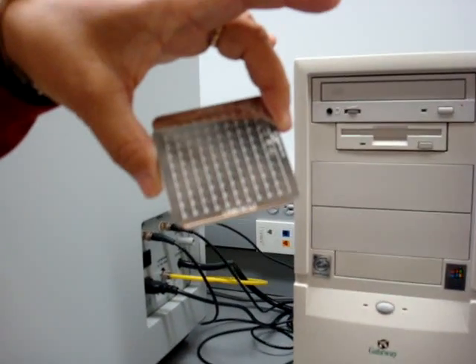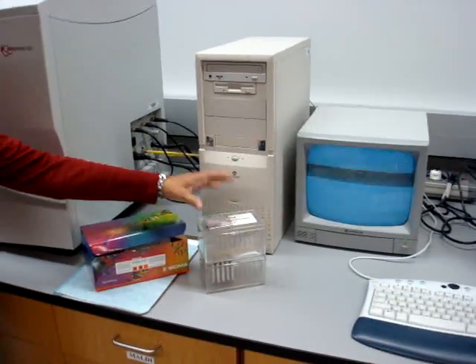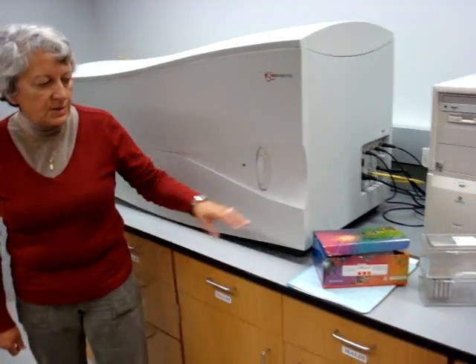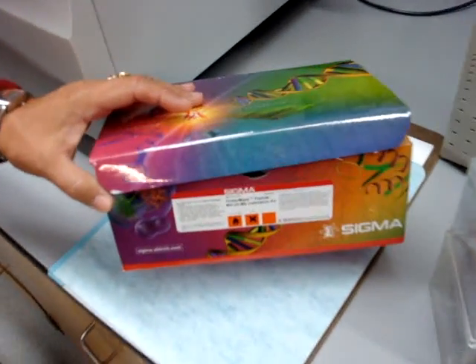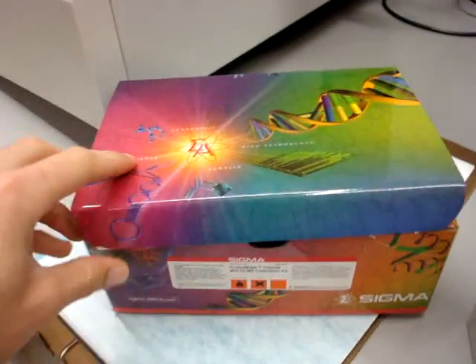We have a program which is on the card inside the computer. We also have a calibration kit for polypeptides, and we have all the manuals.